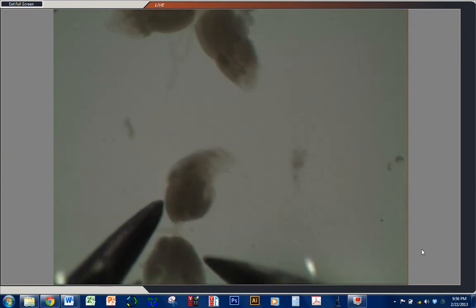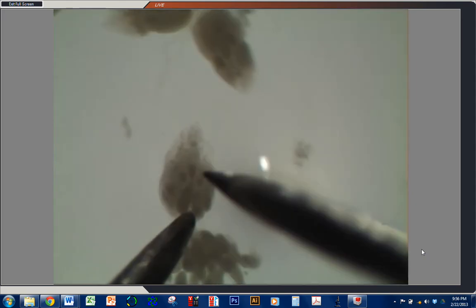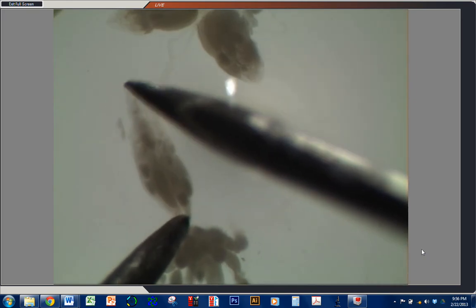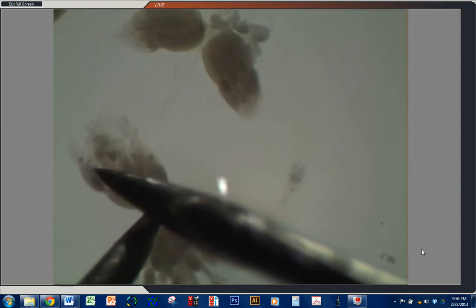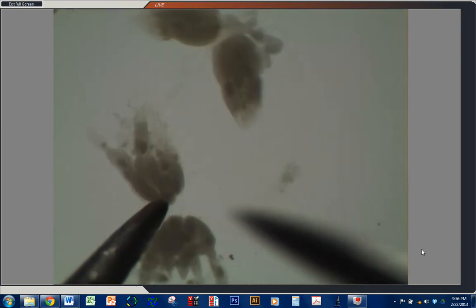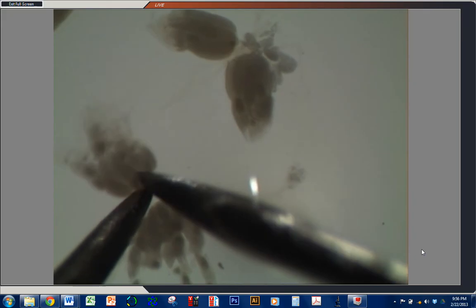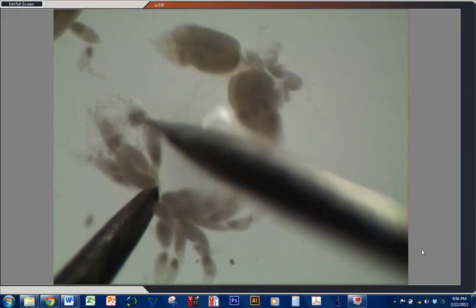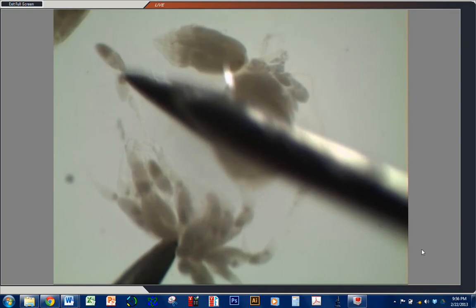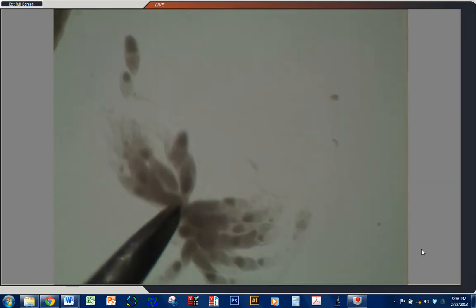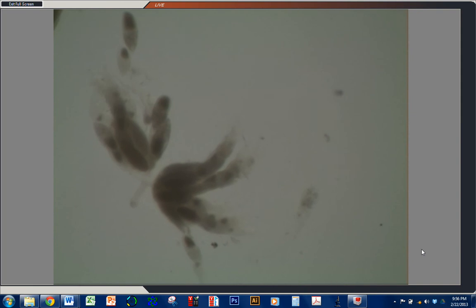So, we'll move on to the left over here. Pin it down and comb it out. You want to start at the anterior and work your way back. Just like if you had tangled hair, you wouldn't want to start right at the base and rip it right out. You can see I lost a varial up here. That's fine, we've got plenty. There you go.